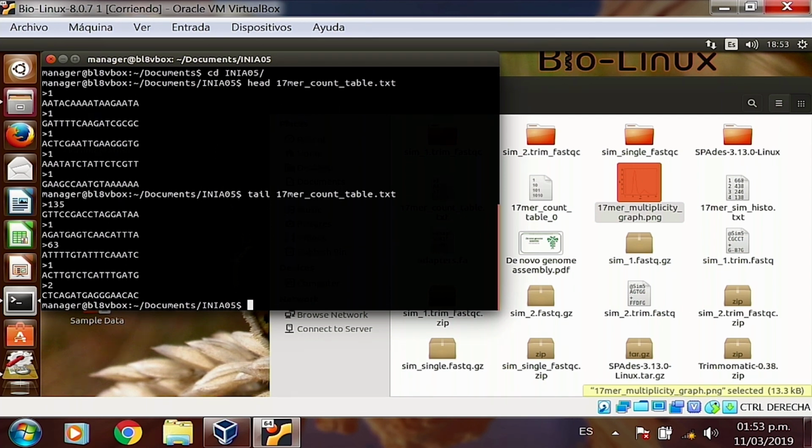Yeah, cool. So now the next step we did, we wanted to see how many Kmers had the same count, or were seen the same amount of times. How many different Kmers were seen the same amount of times? A very quick way to see this is, for example, I'm going to use a little bit of bash and piping. Let's say we want to see what Kmers appeared 5 times.